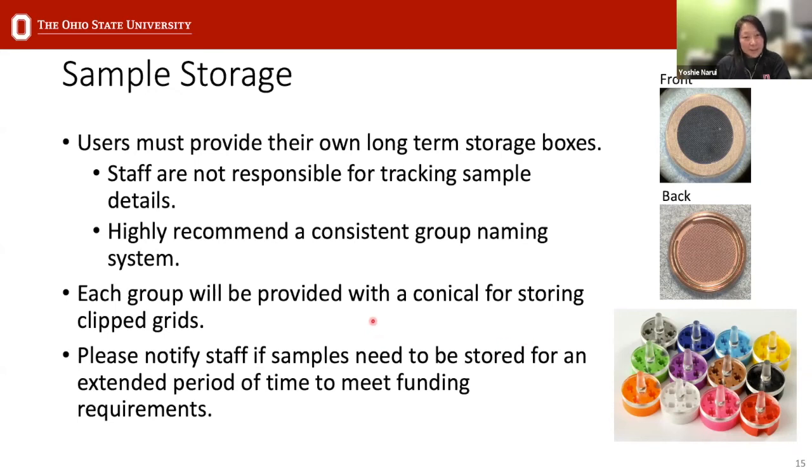We also need to know if there are any requirements for storing your samples for any period of time. In some cases, funding agencies might require that your samples be available for a certain amount of time. If that is the case, please let us know so that we can make sure that's taken care of appropriately. We give each group a 50 ml conical that can hold many boxes like this.